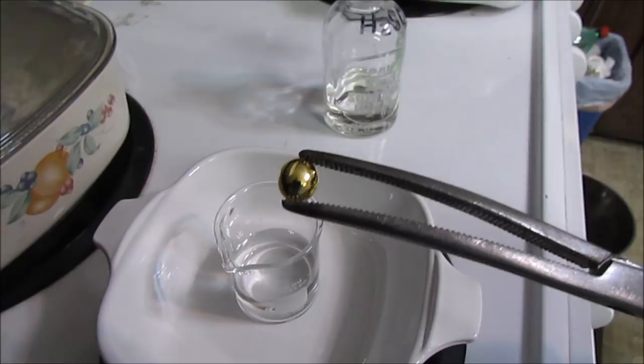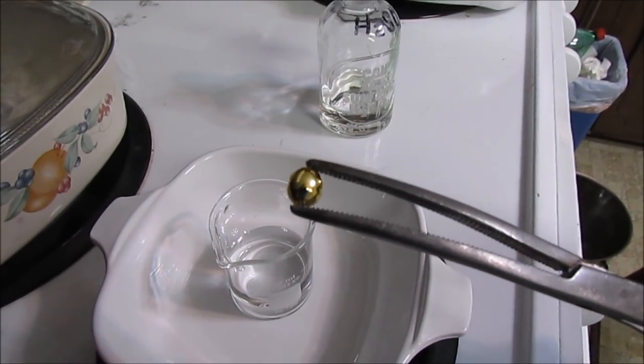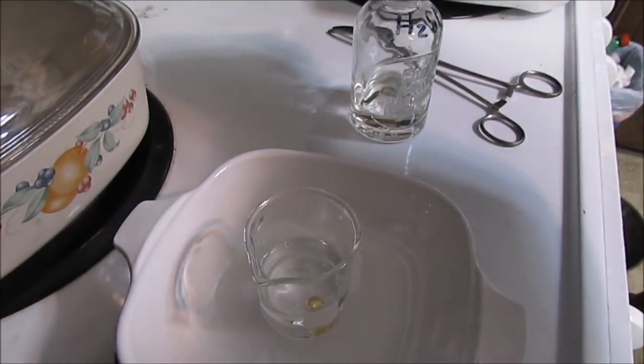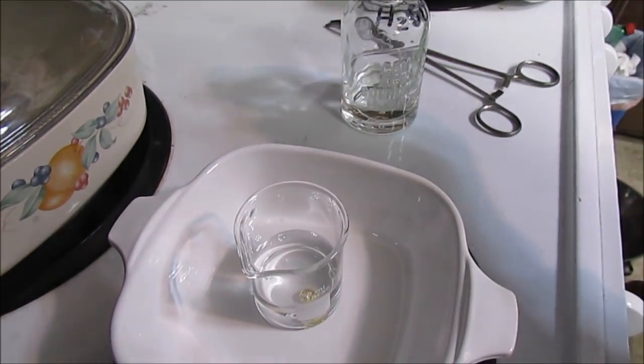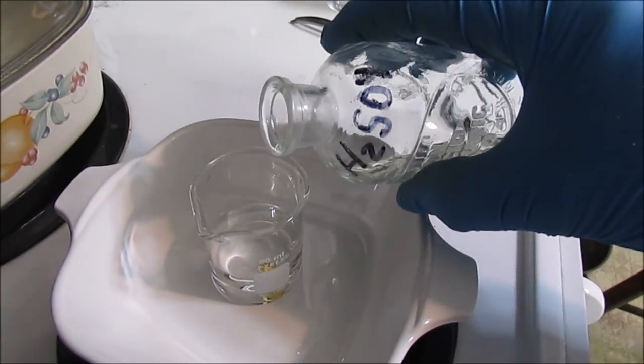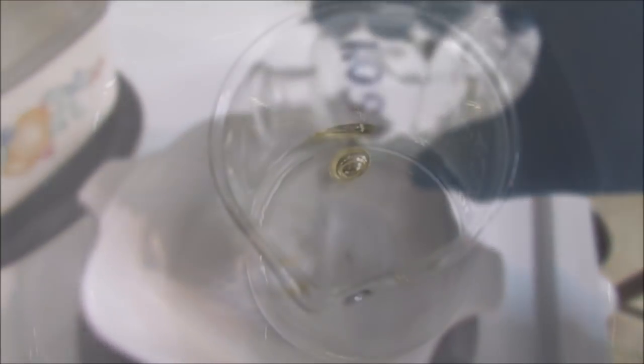Here's our little gold bead. Just got done melting it. I can see myself in it. I'm going to put it in some water here, and I'm going to add a little bit of concentrated sulfuric acid to dissolve off the flux that's sticking to it.